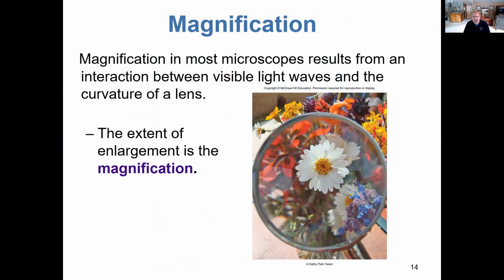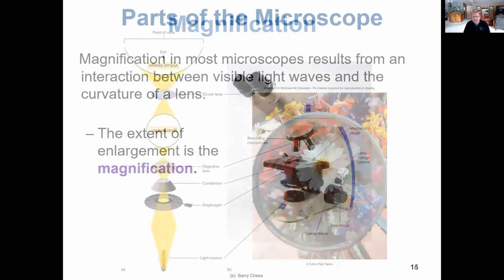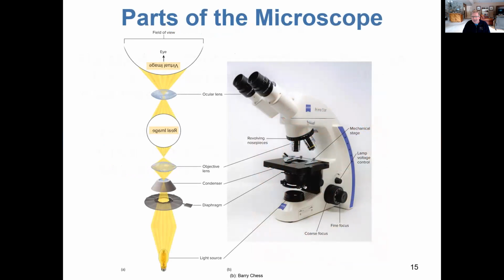We'll be using the compound light microscope in our lab. This isn't exactly the same scope that we have, but most compound light microscopes share similar structures and parts. Obviously, here you see the 2 ocular lenses. We have binocular compound light microscopes as well. Here is the nose piece that houses our 4 objectives. You can't quite see the scanning objective. It's hidden here behind the oil immersion objective. And then the stage that we'll be placing our slide onto, and a little bracket that will hold the slide within this metal part of the stage.